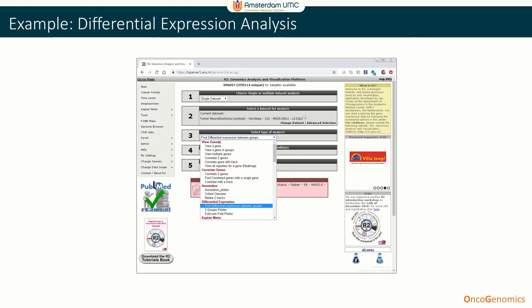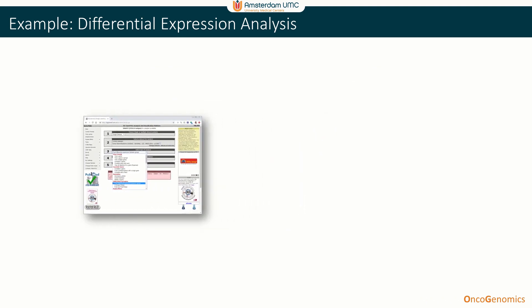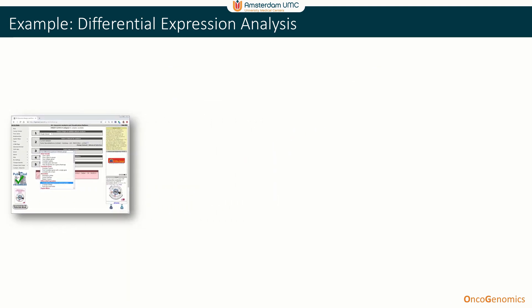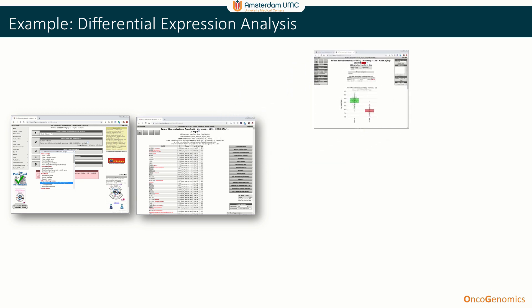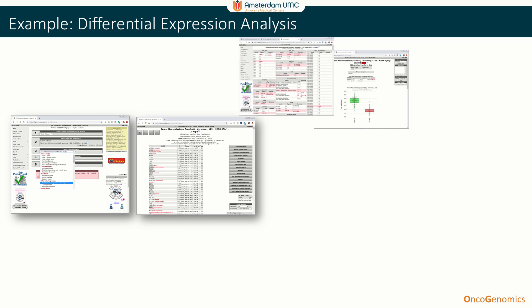To provide you with a sense of the R2 experience, a small example is used as illustration. Within R2, we can look for differential expression between two or more groups of a cohort or experiment. We simply initiate such a search via the main interface and obtain a table filled with results. This interactive table can then be used to explore the results gene by gene with additional analysis.